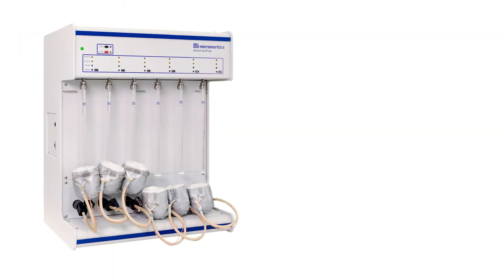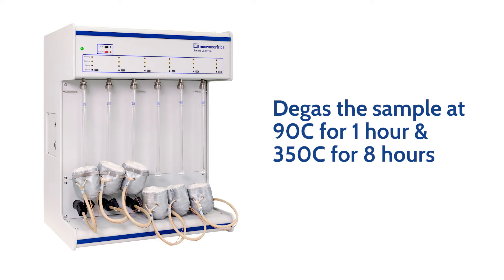Load the sample tube on a separate degas unit and degas at 90 degrees Celsius for one hour and 350 degrees Celsius for eight hours.